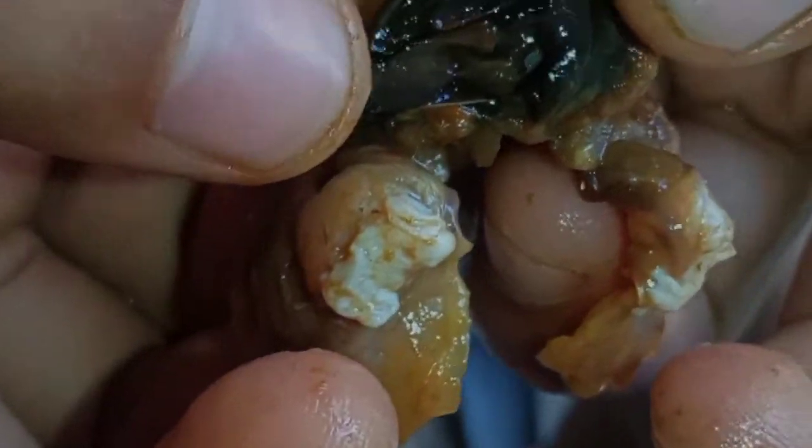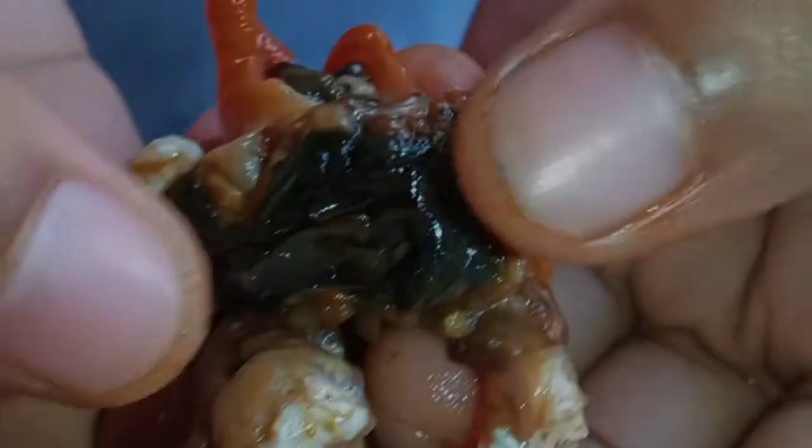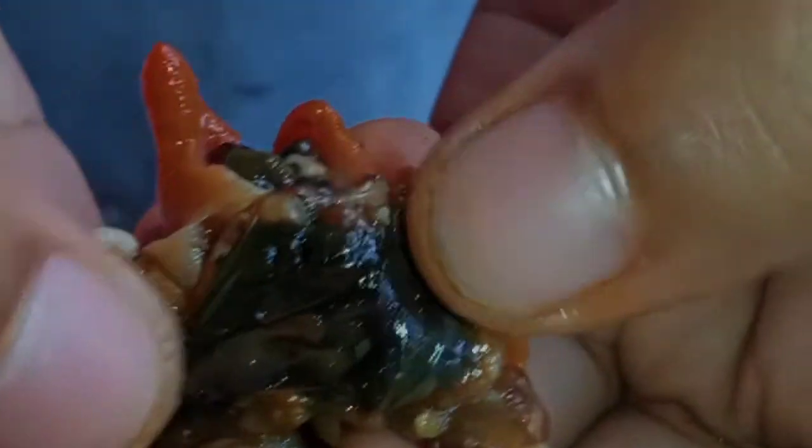Kidney. Liquid waste from the pericardial cavity enters the kidneys, where reabsorption and secretion of nutrients or ions takes place. Kidneys are also able to remove heavy metals from blood.